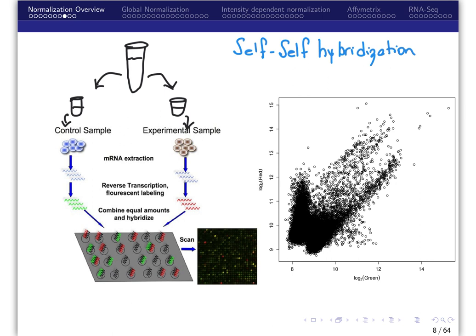Probes are fragments of cDNA spotted in circles by a series of print tips on the surface of the array. However, there are often variations in the amount of deposited probe DNA among spots on the same array. This is often called between print tip variability, but there also may be variability in the amount of probe DNA printed between spots on different arrays for the same print tip, that is, within print tip variability. There also could be differences in the size and shape of deposited target.